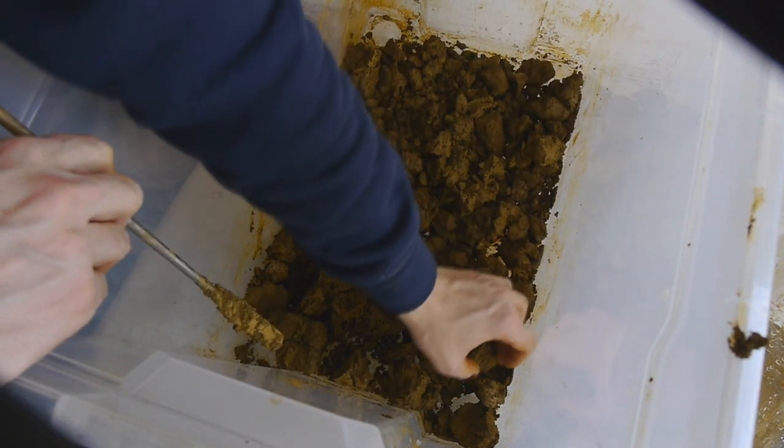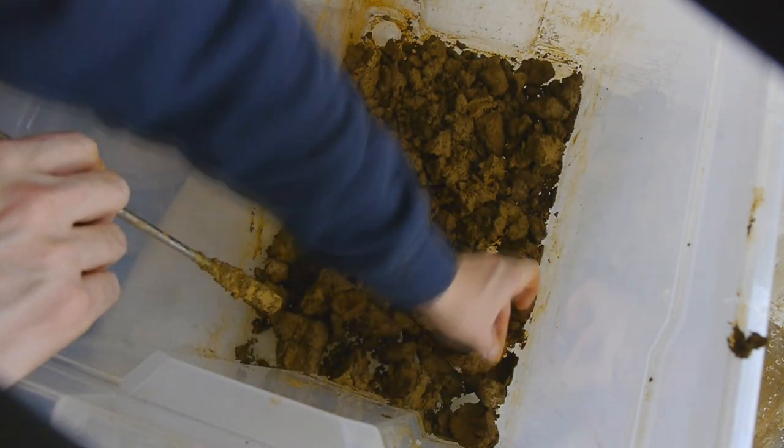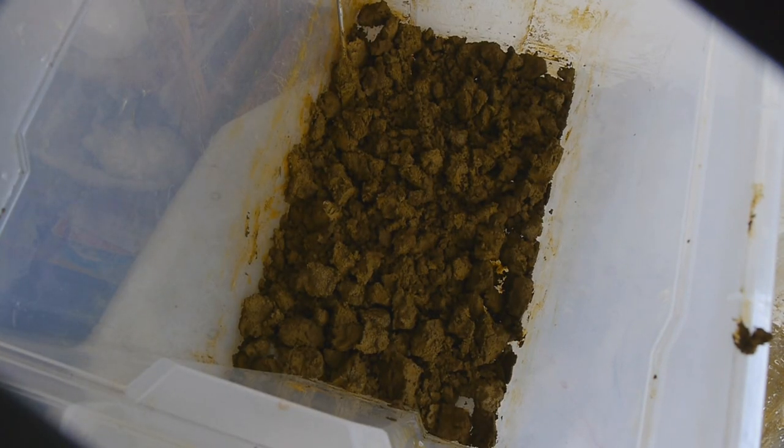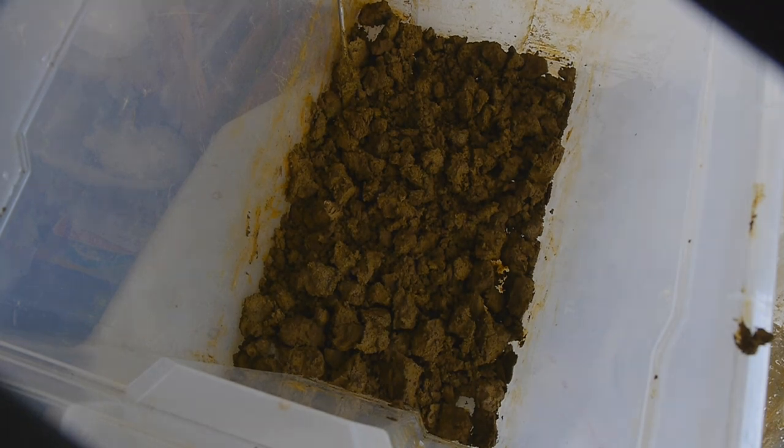There's a hair in my iron oxide. Looks like a cat hair. Stupid cat. Okay, now let's just put this in a warm and dry place. And then we need to heat it to dehydrate and then it's done.